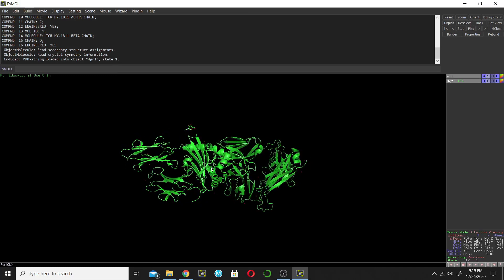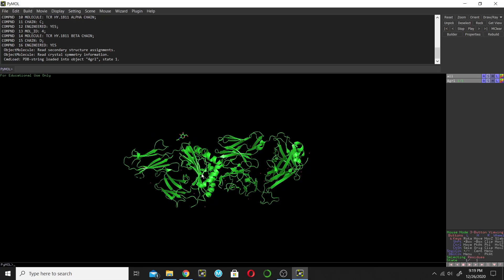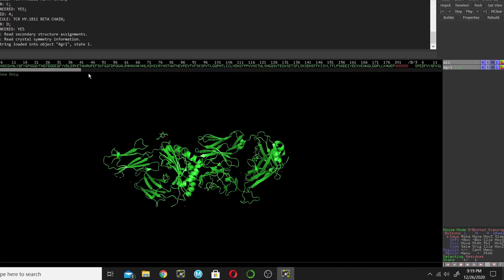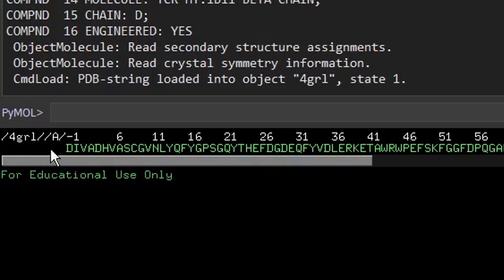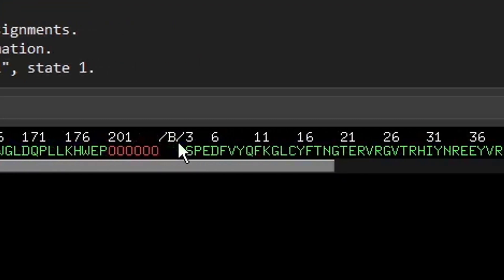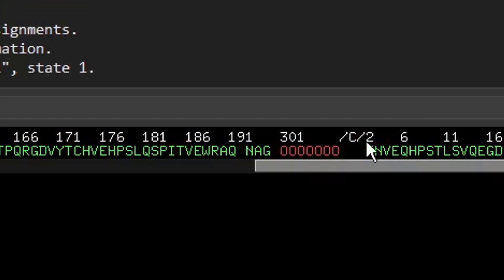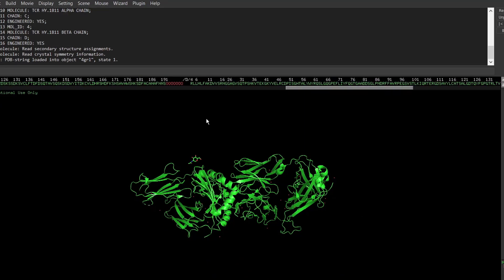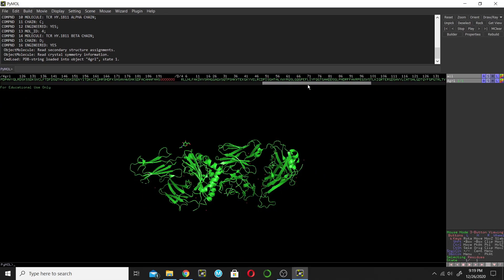How to find the chains? We can find them in different ways. The first way is by showing the sequence — go and show the sequence from here. Click on the S option. This is the sequence, and from here you can find the chains. This is chain A, this is chain B, this is chain C, and this is chain D. So this protein has four chains: A, B, C, and D.